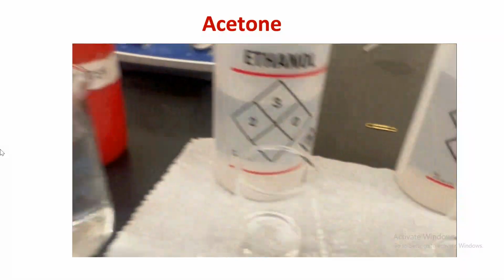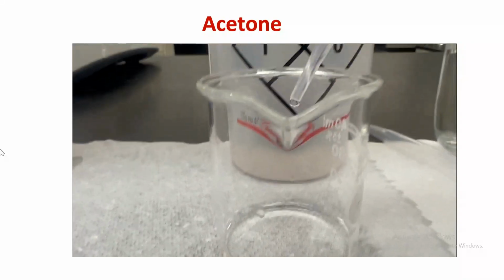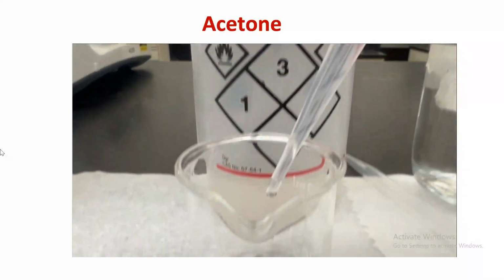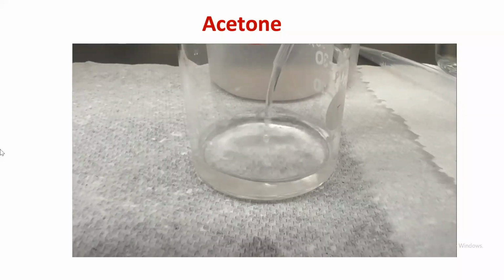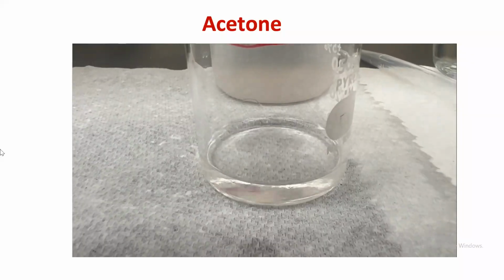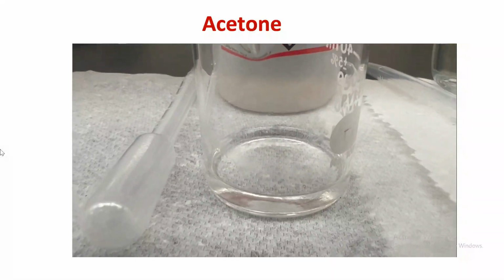It has no ions. Distilled means it's pure water. Record your observation. Water is being added to acetone. Acetone is a type of ketone.